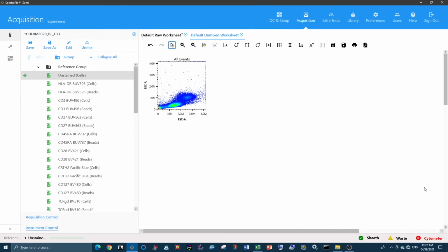Okay, our unmixing has finished. So now we're going to evaluate this unmixing. We unmixed using all beads as our controls. Now we need to see what the single stained cells look like using this unmixing, as what we're trying to do is decide whether beads are sufficient for unmixing cells. If there's a spectral signature mismatch between the beads and the cells, if our beads weren't a good enough control, then the unmixing that we see with our single stained cells will have errors in it. Then we can change the control that we used from beads to cells and go forward with another iteration of the unmixing.